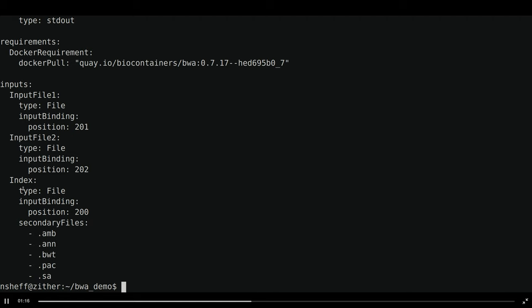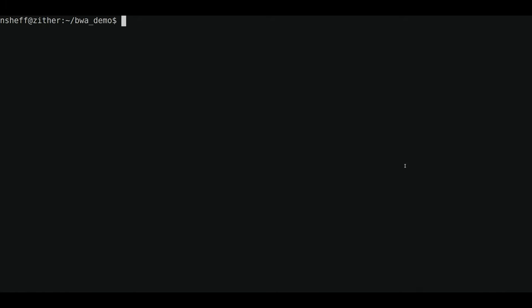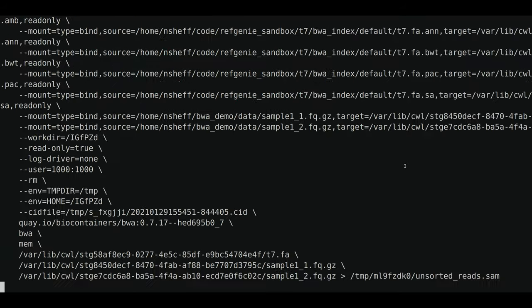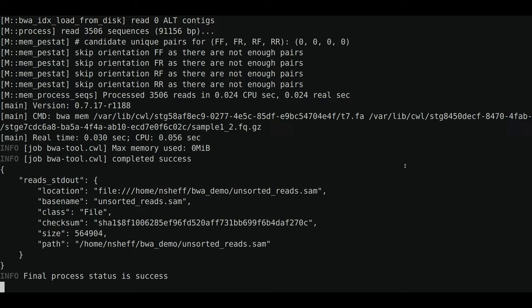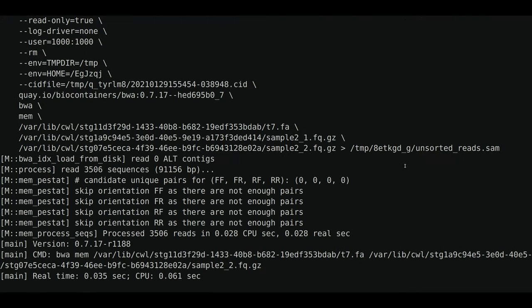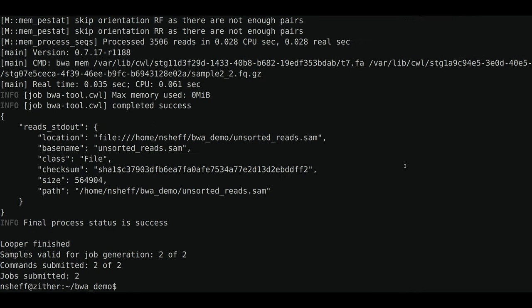Here we have the CWL runner command that's showing that we're going to call the BWA tool file. And we have the pre-submission hook here calling the write sample YAML CWL. So let's take a look now at the BWA tool file, which is your basic CWL file. It's got three inputs: input file one, input file two, and index. And notice here that it's also got a Docker requirement showing you that this is the Docker container that this particular CWL tool is going to run in. So now let's go ahead and run this project by calling looper run and passing it that project config file that we just looked at. And you can see here that looper is going to just go through each sample one at a time, create the YAML files for CWL and then call CWL runner. And these have both succeeded.